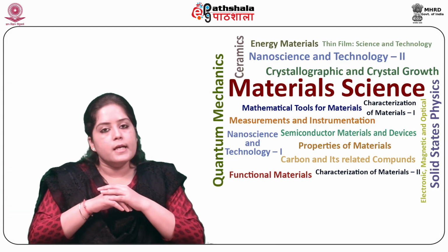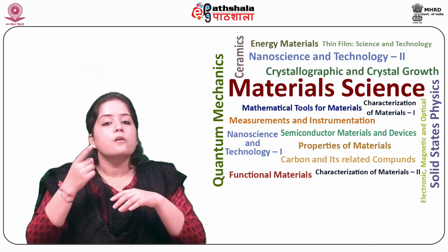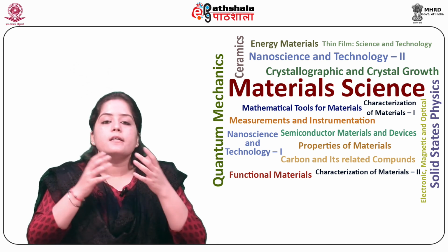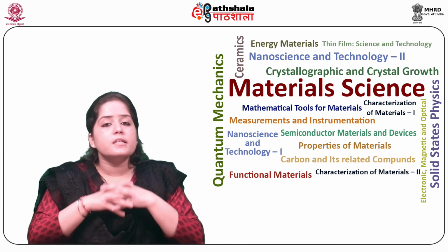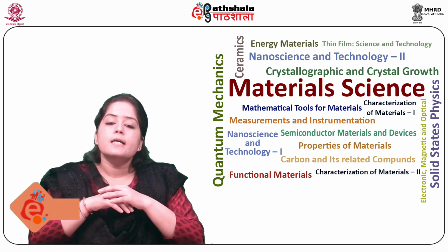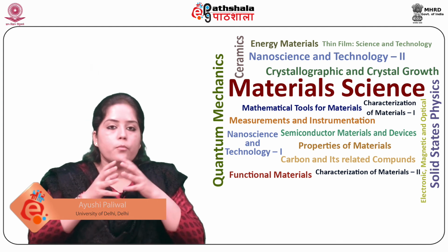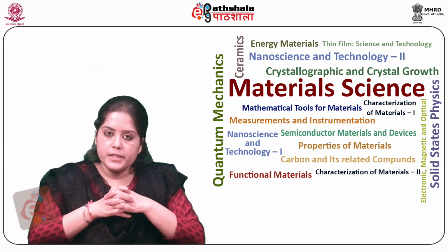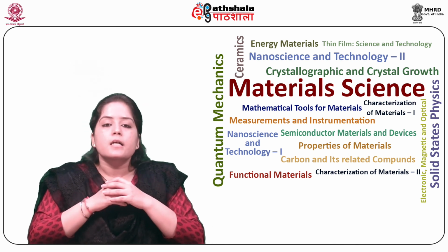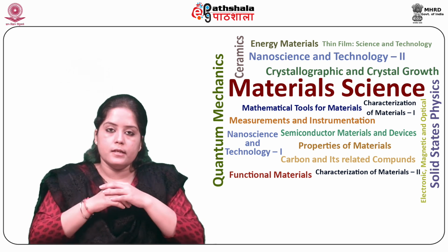So students, let us summarize what we have learnt in this module. First, we discussed the working of FTIR spectrometer, that is, how does it work, along with the detailed description of Michelson interferometer. Secondly, we discussed the OPD and ZPD, which are very important parameters to study FTIR. Then we discussed the interferogram. Lastly, an introduction about the FTIR sampling was discussed. Thank you.